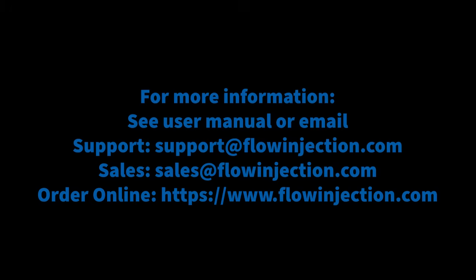If you need more information, we've compiled a thorough breakdown of this process in the user manual that came with your column.